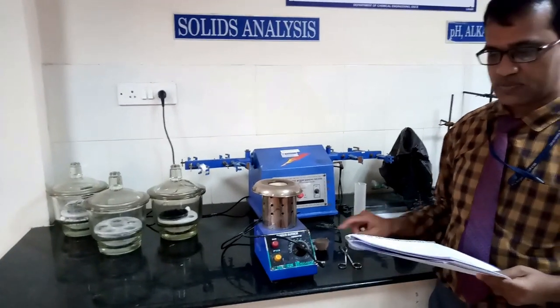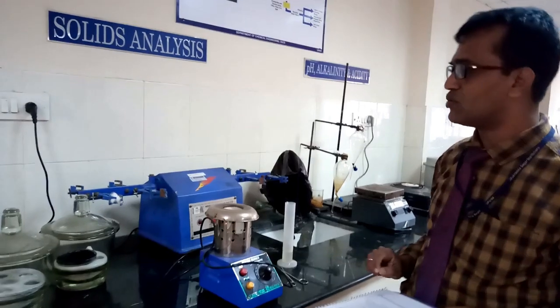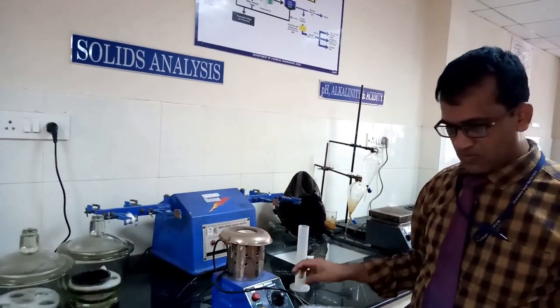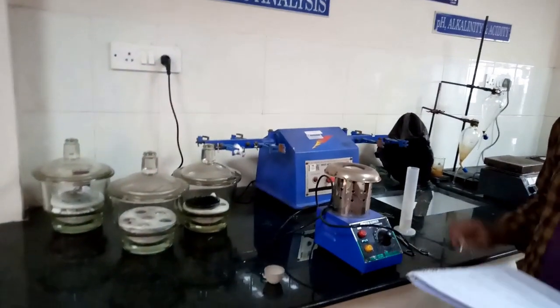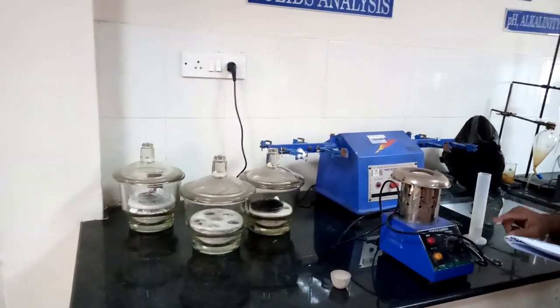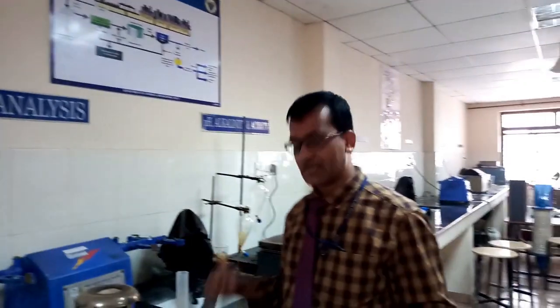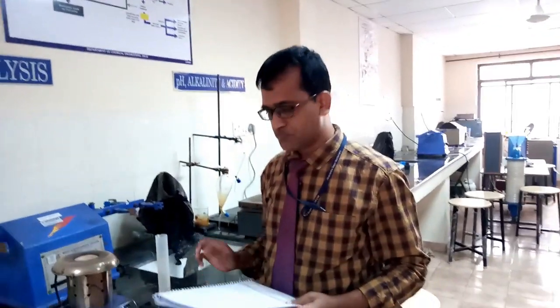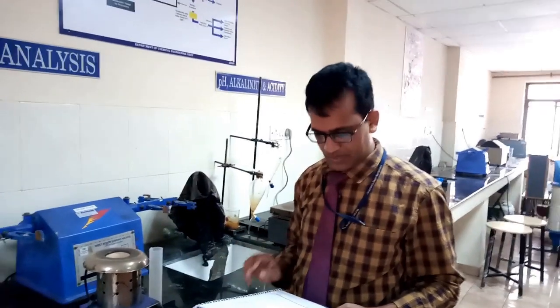This is the second experiment, that is estimation of total volatile and fixed solids. Here your aim is to determine the total fixed solids and total volatile solids. The apparatus required are a silica crucible, a muffle furnace, an oven to preheat, an electronic balance, and measuring jars. So these are the main important apparatus required.